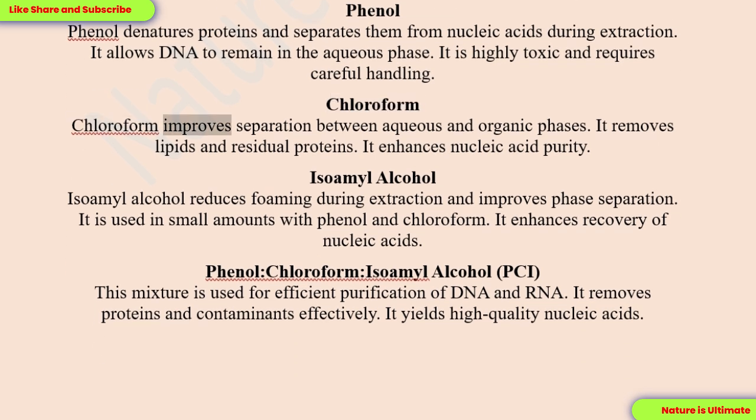Chloroform. Chloroform improves separation between aqueous and organic phases. It removes lipids and residual proteins. It enhances nucleic acid purity.